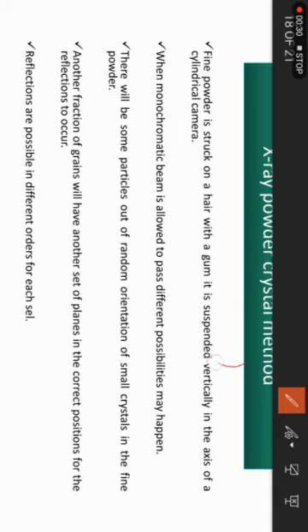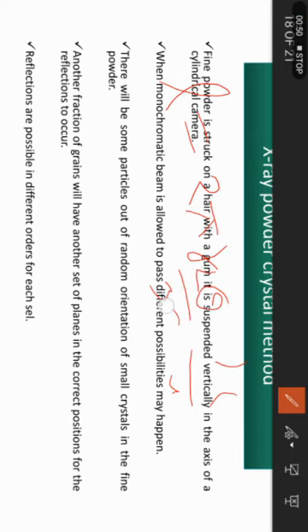As I told you, the length between this arc was L, so that L is the arc which we are using. Here 2 pi r is the circumference, and r is the radius of that cylindrical film that we have used. So this gives the relation for theta.